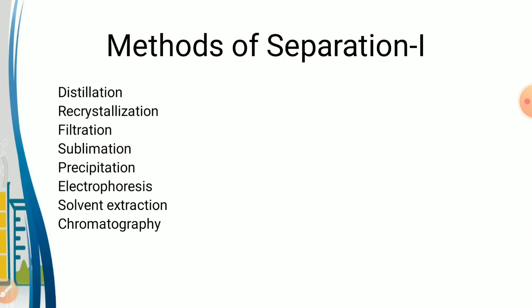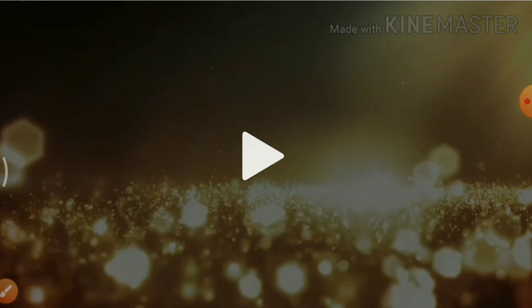Separation is carried out by various methods such as distillation, recrystallization, filtration, sublimation, precipitation, electrophoresis, solvent extraction, and chromatography, which is nowadays the most famous technique. In this unit, we are going to learn solvent extraction and chromatographic methods such as HPLC, that is high performance liquid chromatography, and HPTLC, that is high performance thin layer chromatography.